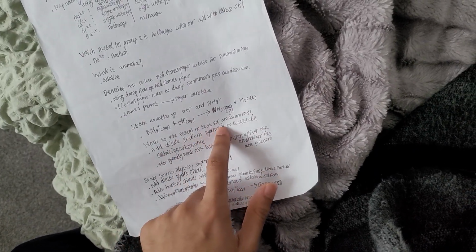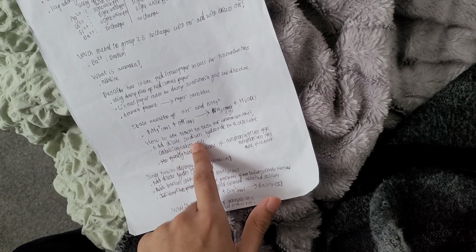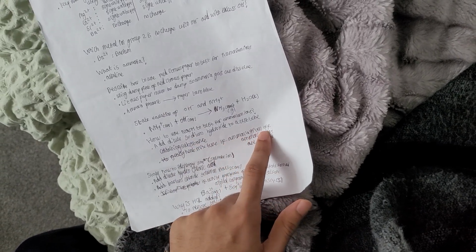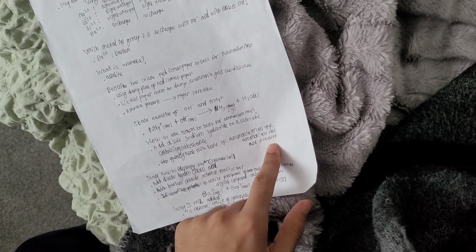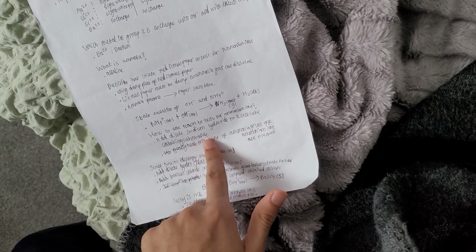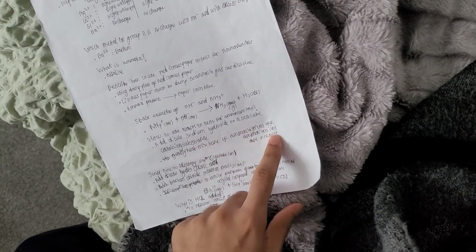How to use NaOH to test for ammonium ions? Add dilute sodium hydroxide to a solution containing the substance and gently heat the mixture. And if ammonia is given off, ammonium ions are present. So add dilute sodium hydroxide to a test tube containing the substance, gently heat the mixture. If ammonia is given off, ammonium ions are present.